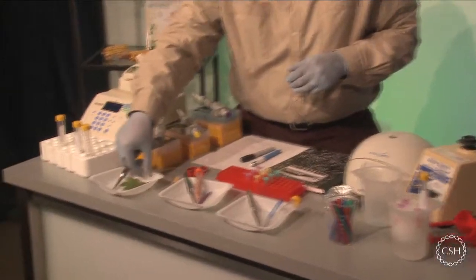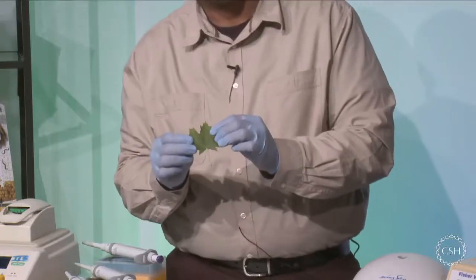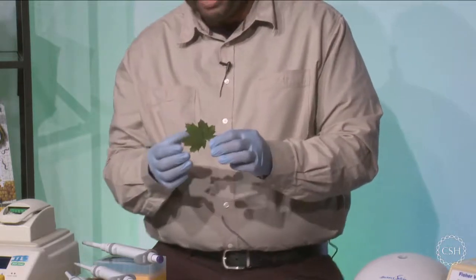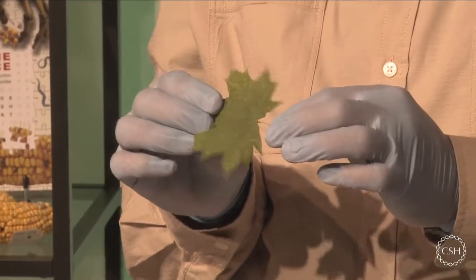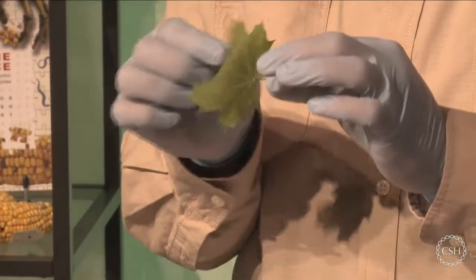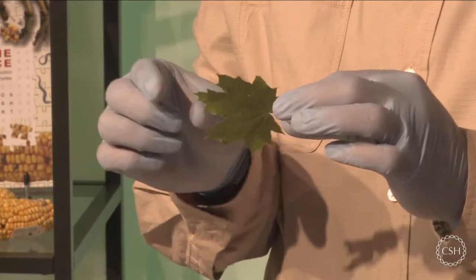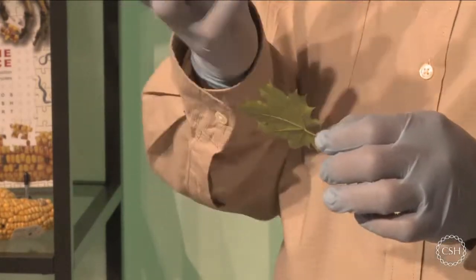And what you see here is I have just a leaf from a tree that I plucked outside. But you can see that it's not very shiny. And this actually is a really good plant to pull from. If you see something that's really shiny, it might have a lot of carbohydrates or things like polyphenols, which are contaminants. And it may make this a little bit tougher or harder to physically work with. So you're going to be mindful that you might want to do a little bit harder crushing when you have a more rough plant.